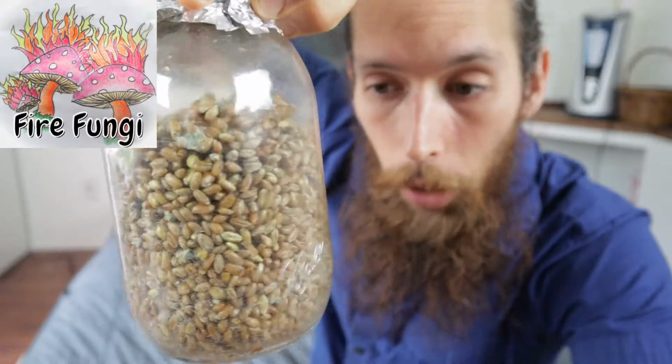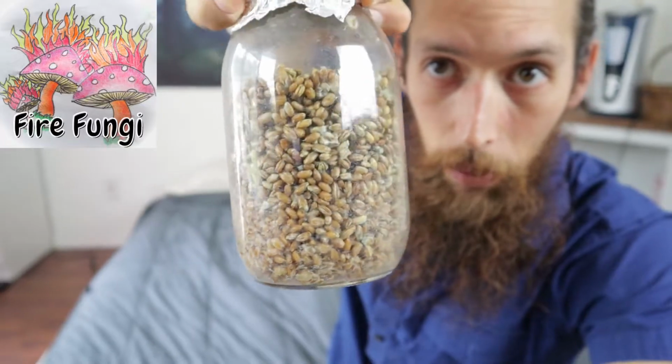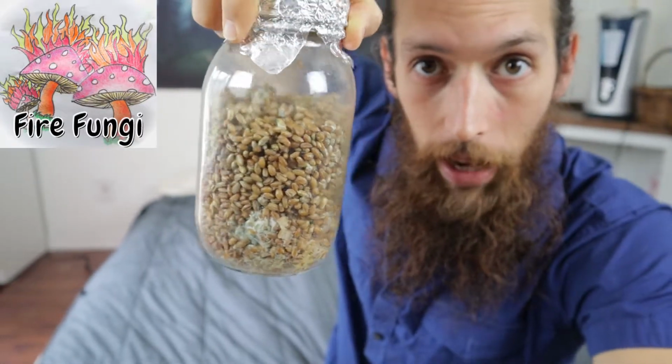All right, so we have this all broken up. There's a little patch right here you can still see. I'm not too worried about that, we'll just leave it. And then we're going to go ahead and put this back in the proof box. Alrighty, so those jars of grain spawn are tucked back into the proof box. And like I said, it's been 10 days since I first inoculated them with the liquid culture. And I'm pretty happy with how they've turned out so far. It doesn't look like there's any real signs of contamination.